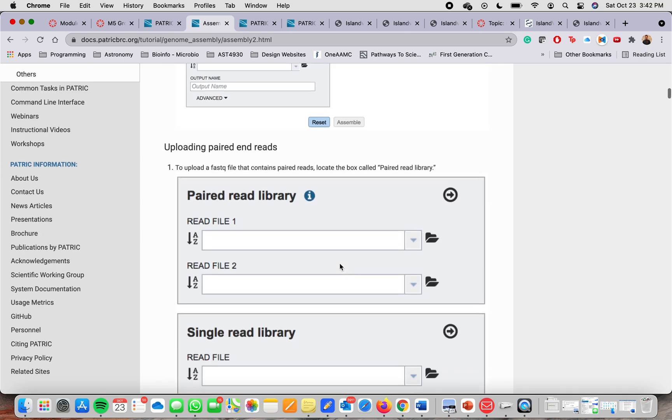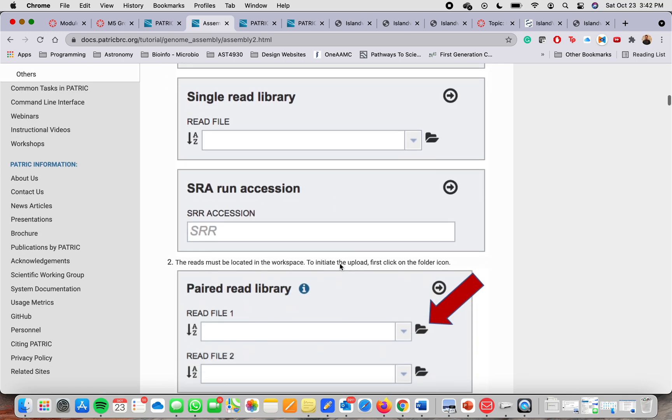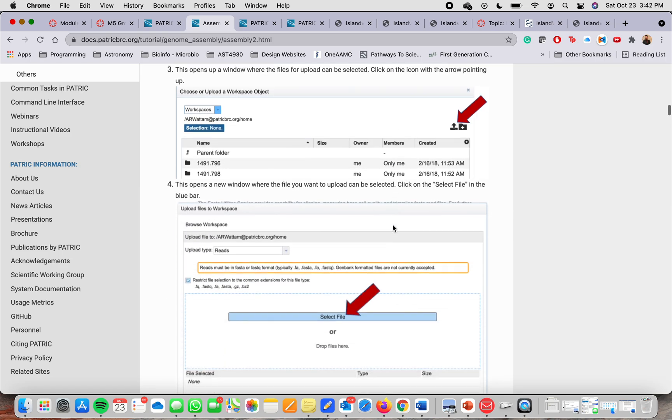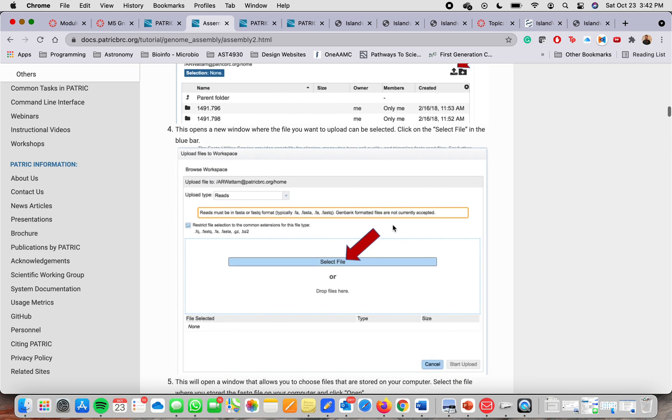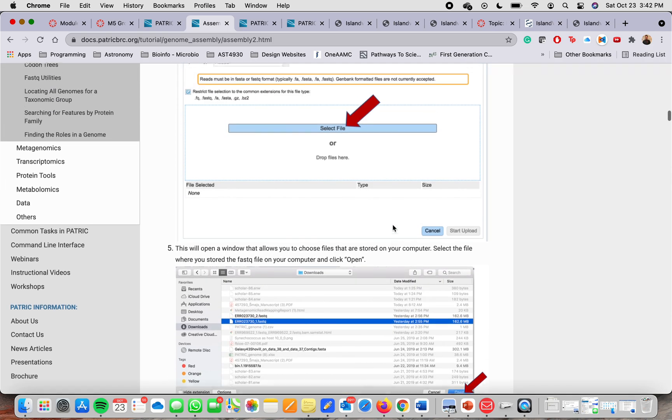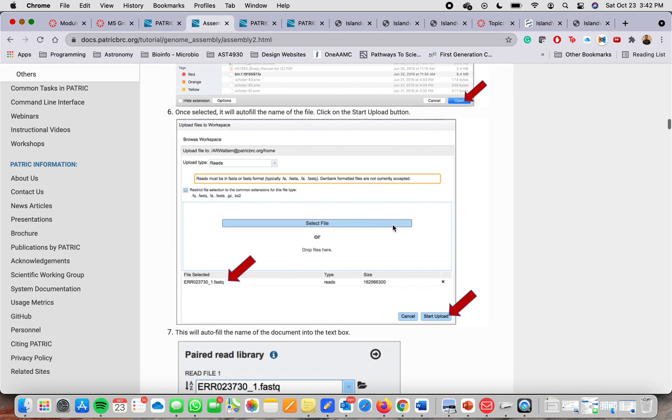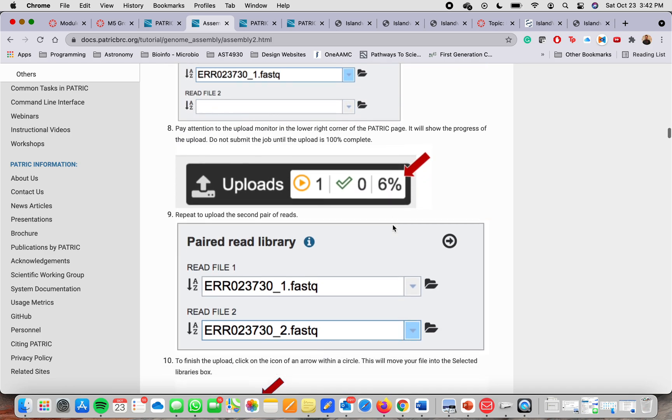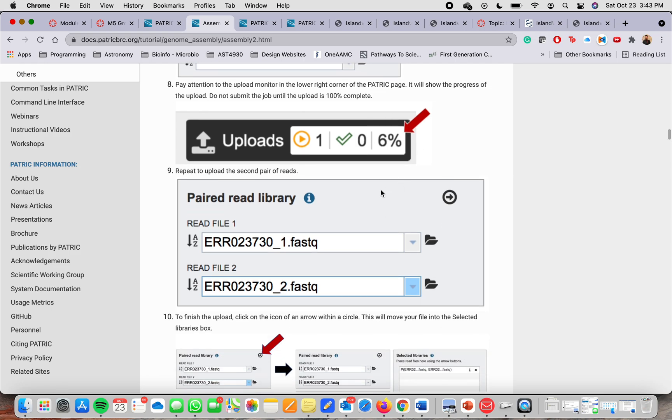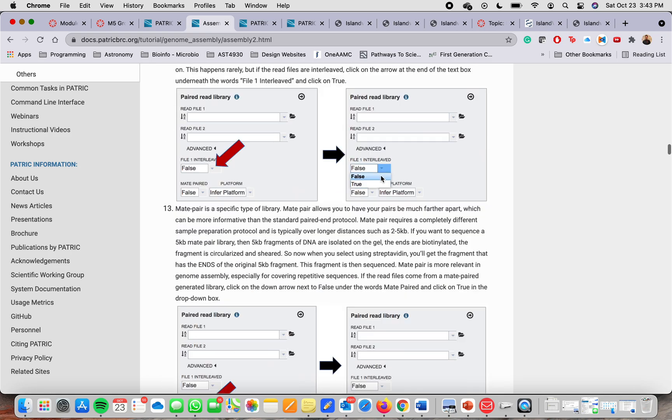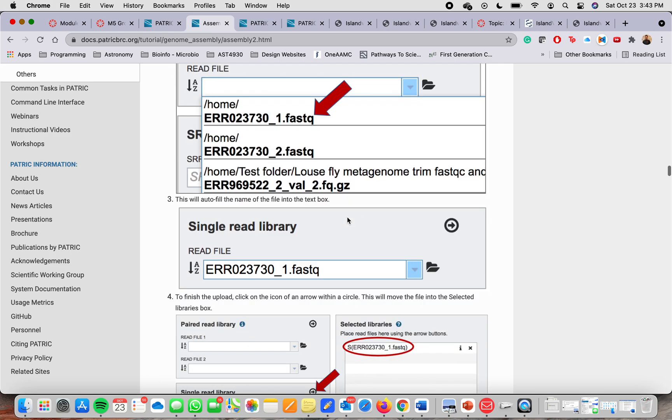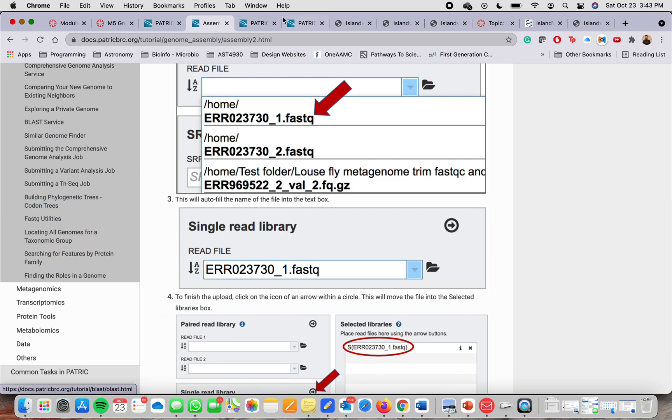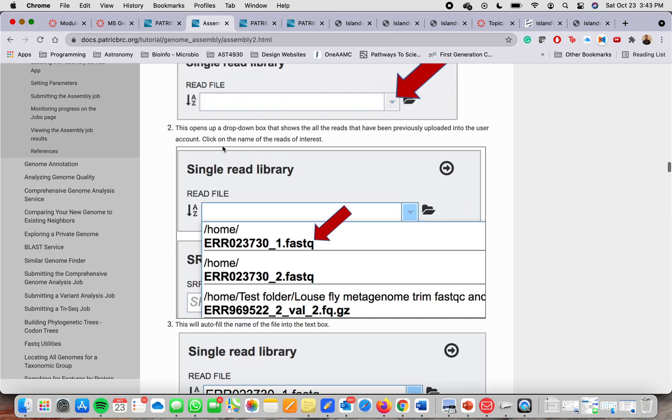It's very detailed. It gives you images. It's telling you what to do next, what's going to happen when you click there or not. It will show you when something is running complete or the percentage of the complete work. And here you'll find all the information you need in case you don't know how to do something.